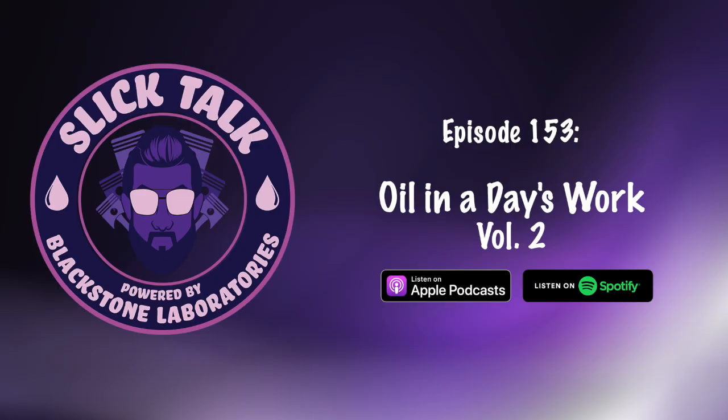Today I want to take you through 3 different samples I was working on during the day where I noticed that all 3 gave a nice overview of the range of systems that we'll see an oil sample from and how we evaluate these results differently depending on what type of system it is that you're sampling. So 3 different oils, 3 different narratives, 3 different breakdowns where I can tell you what these results meant to the client and what they need to do based on how things turned out.